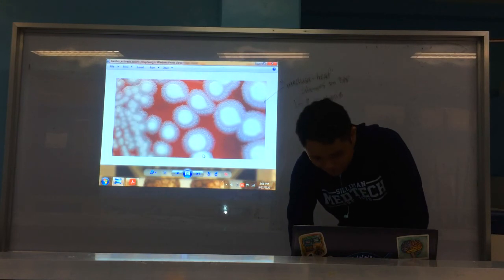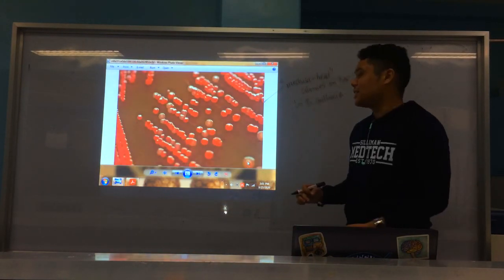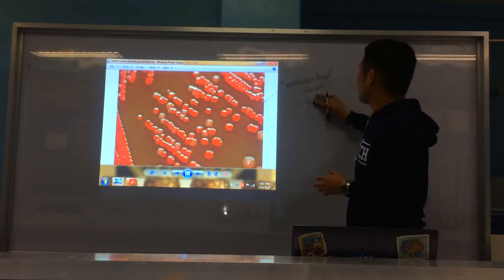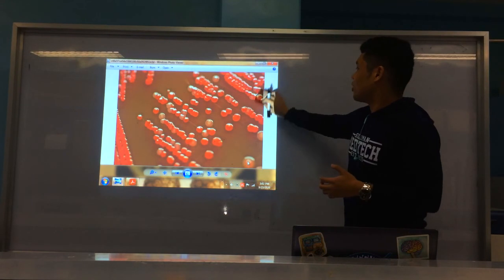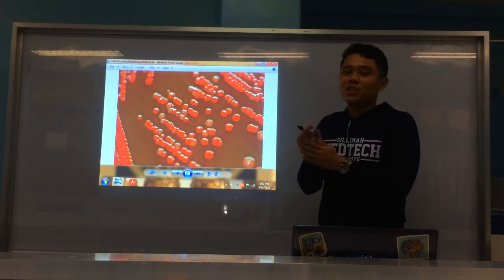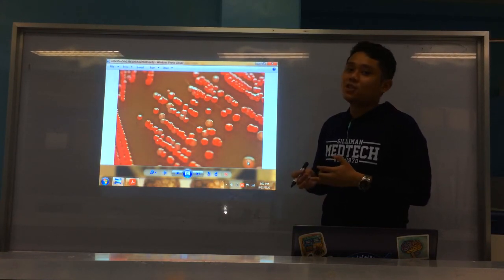And ang cover photo na po sa section F, yan, characteristic. Oh, di ba? Very nice. It's so nice. Bloody red. I love it so much. Di ba? Next case of color good. This is, wala nang iba. Kaysa itong red colonies na to, we have Serratia marcescens. And unsa ganito na pigment ang nakakos yung pagka-red, prodigiusin.